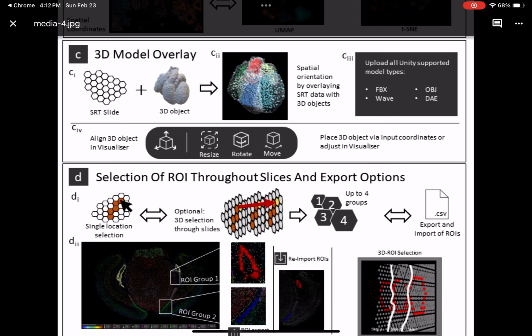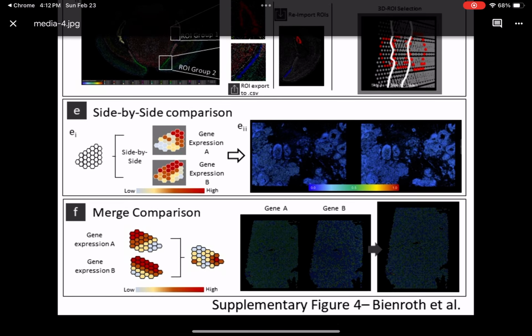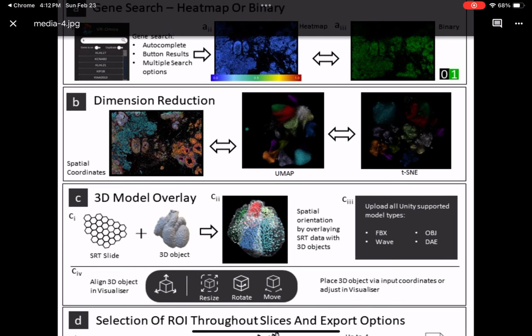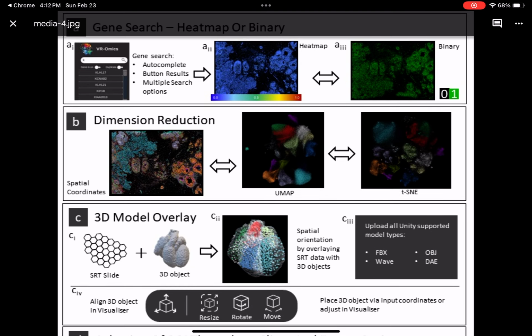All samples were sequenced using the Visium FFPE spatial solution in conjunction with the Advanced Genomics Facility at the Walter and Eliza Hall Institute, WEHI. Samples of patient MCTHB302 were sequenced in the first batch, while the samples of MCTHB361 and of MCTHB362 were sequenced in a subsequent batch. Samples were sectioned as necessary to fit Visium capture areas, Figure 3,5 and Supplementary Figure 8.